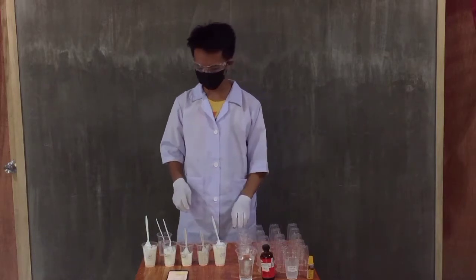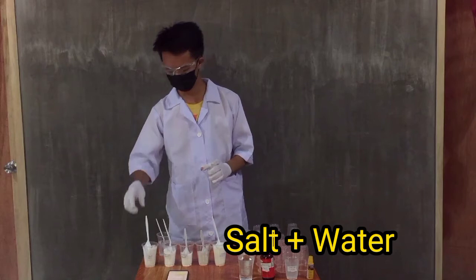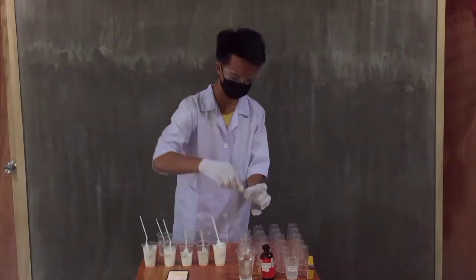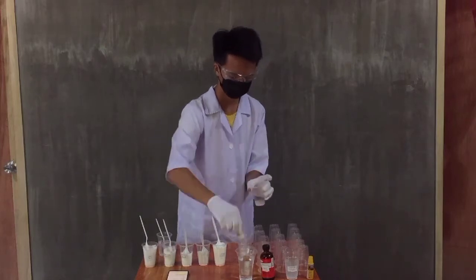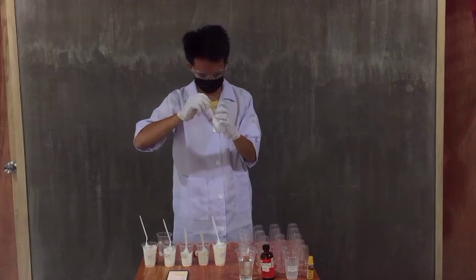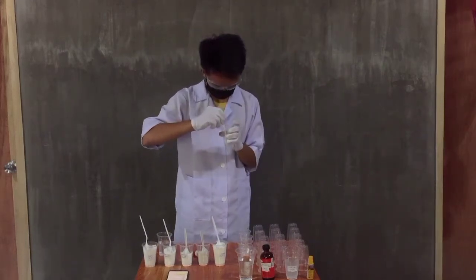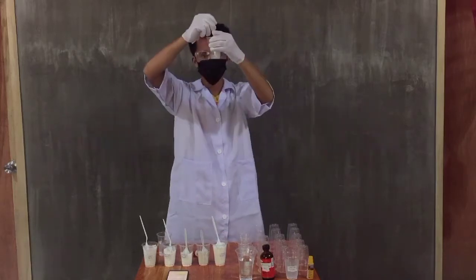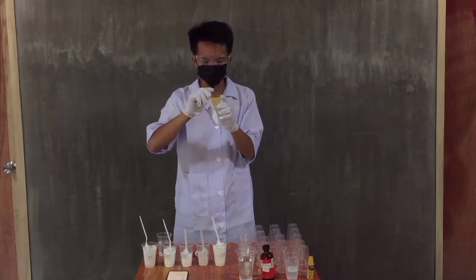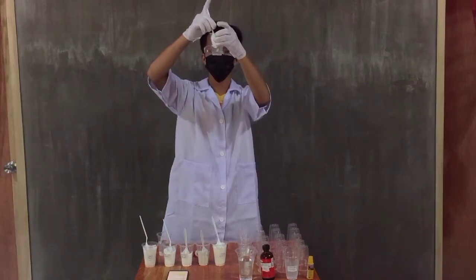The last one is the mixture of water and the salt. In this mixture, the salt dissolved in the water, but there is no precipitation formed.